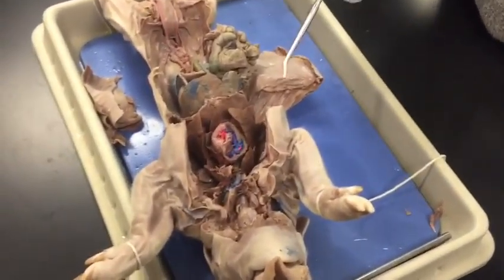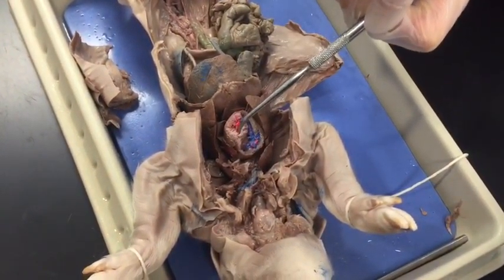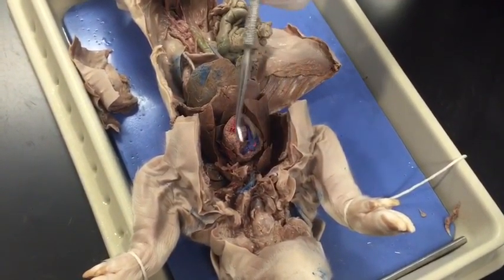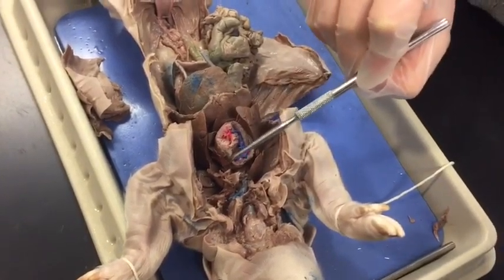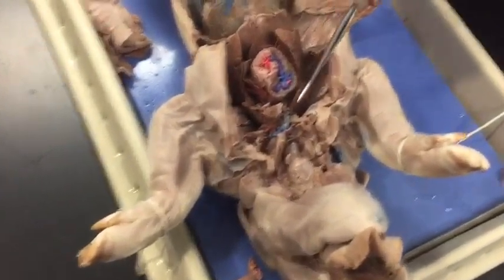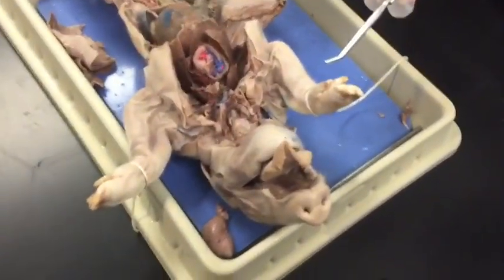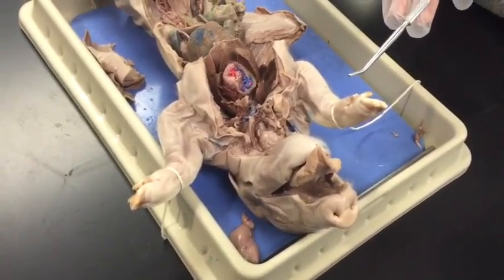The aorta begins at the left ventricle, which is basically the muscular pumping chamber, so it's up here. The superior and inferior vena cava are surrounding the heart.